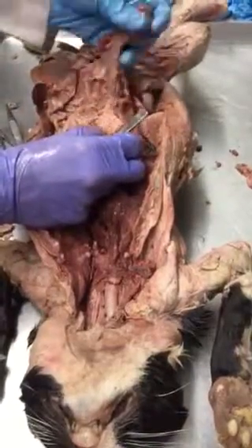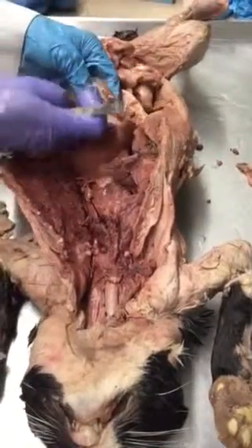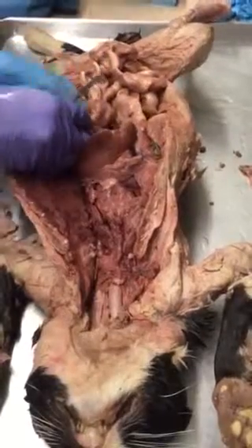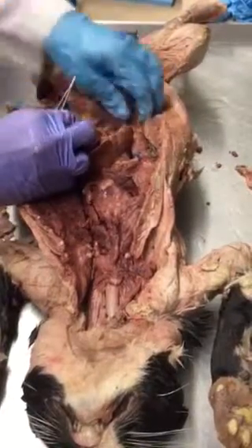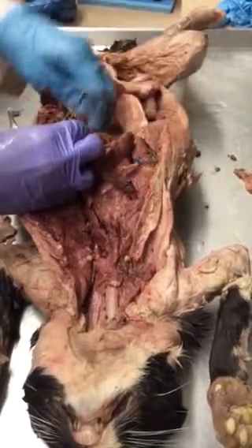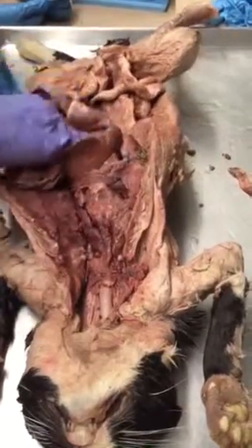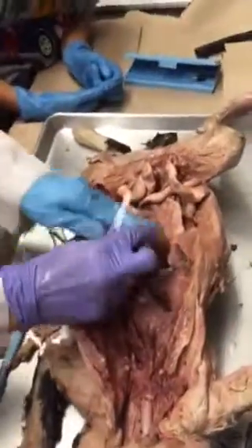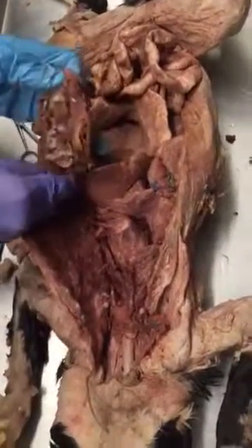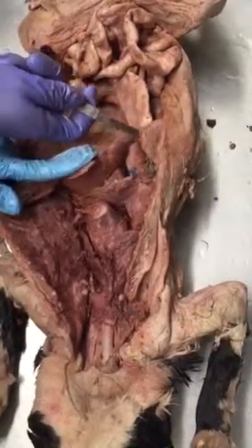One more organ I want to add before I look at some other stuff. That initial curve of the duodenum coming off of the stomach has an organ tucked into it, and it's probably the trickiest one out of all of them, because it doesn't feel like an organ. It feels like it's just extra fat or something. I've pushed the greater omentum up. The stomach is right underneath here, and this is the beginning portion of the duodenum right here.